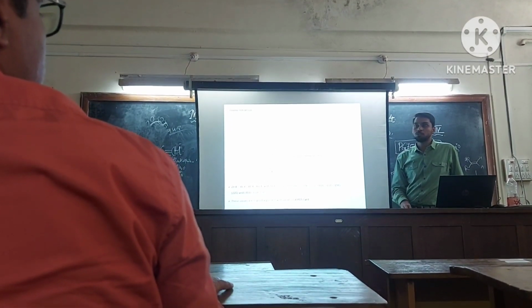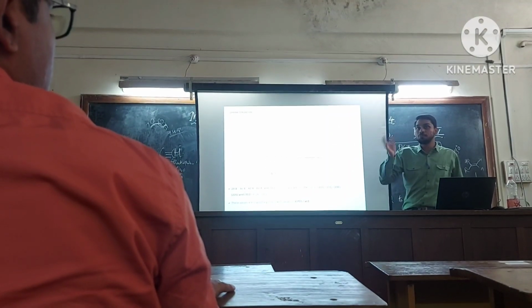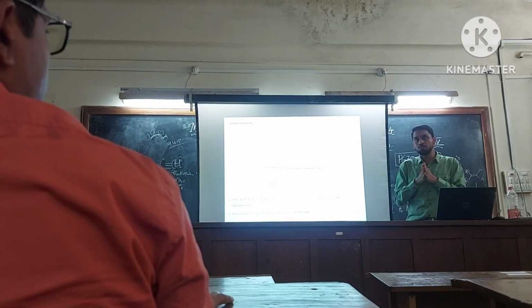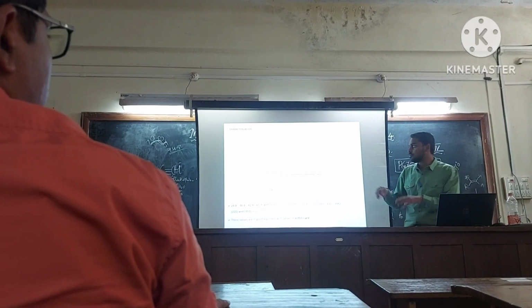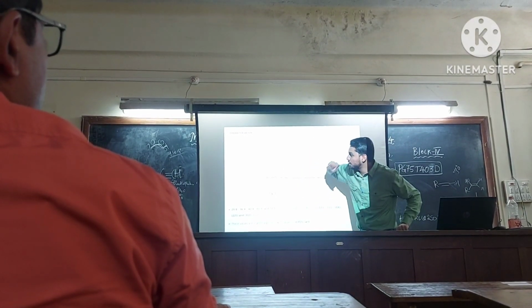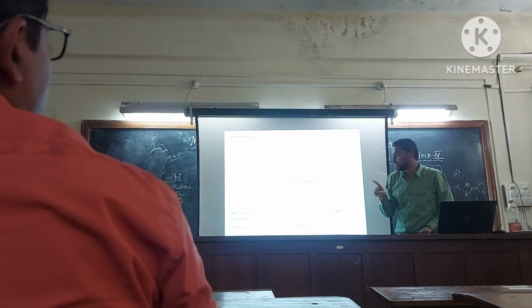We compared it with Cu+1, sir. Only that. Its miller indices do not match with this, sir. So what we mainly needed was to verify that +1 is present, which is important, sir. And there are no other +1 elements. So the miller indices, like if this peak, 200 peak, these two peaks were definitely for copper +1 itself. That's why I'm just asking.